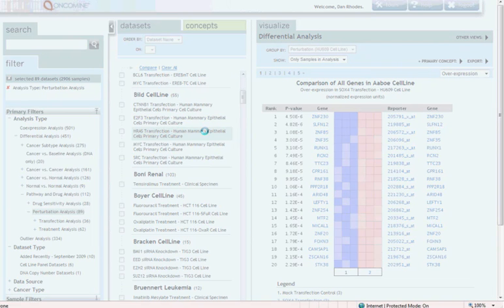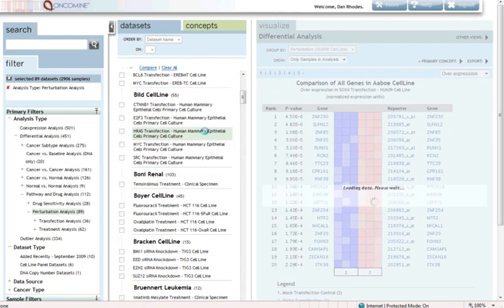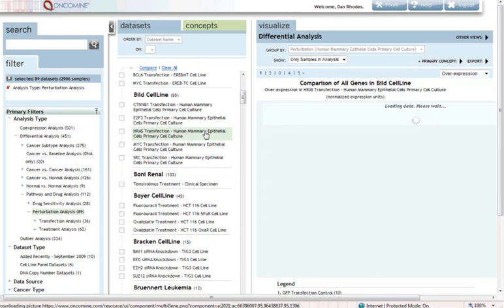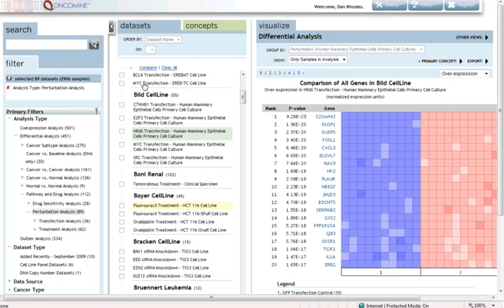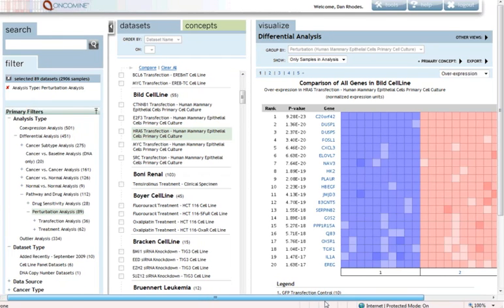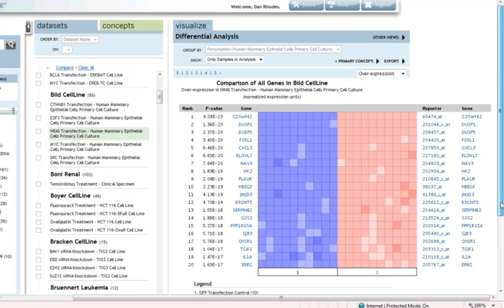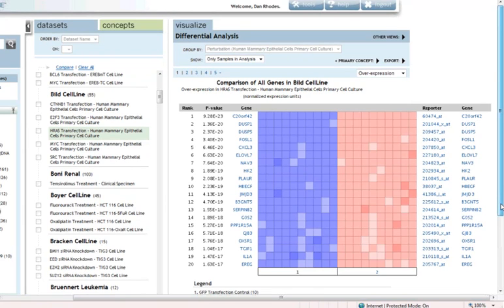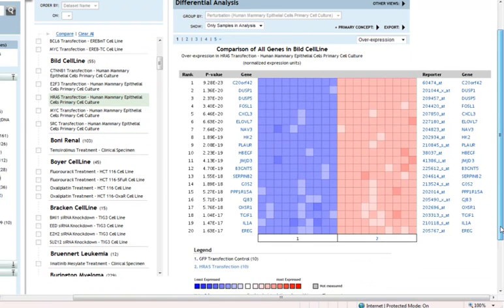I'm going to look at this RAS transfection analysis in the Bild cell line study. This is a study that many of you are probably familiar with. This is work by Joe Nevins, in which a variety of oncogenes were transfected in human mammary epithelial cells relative to control.